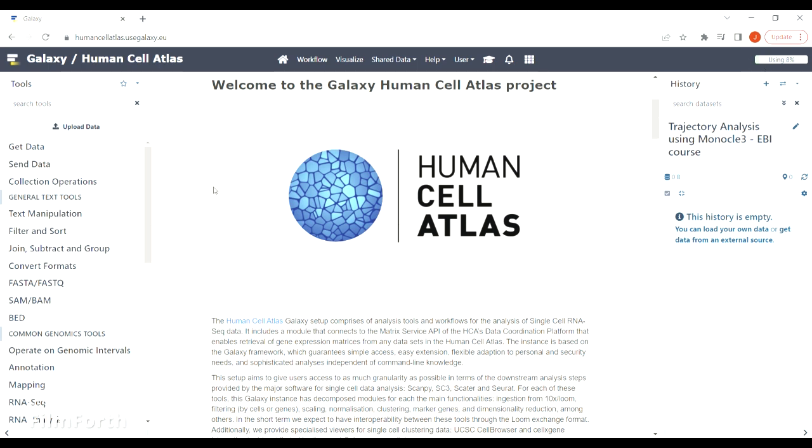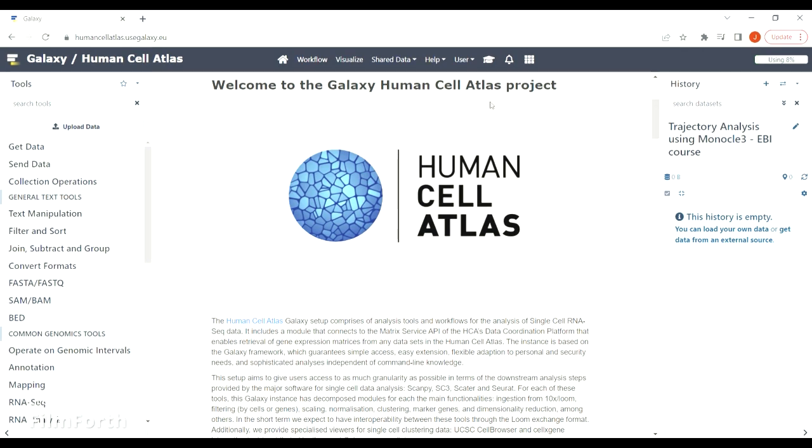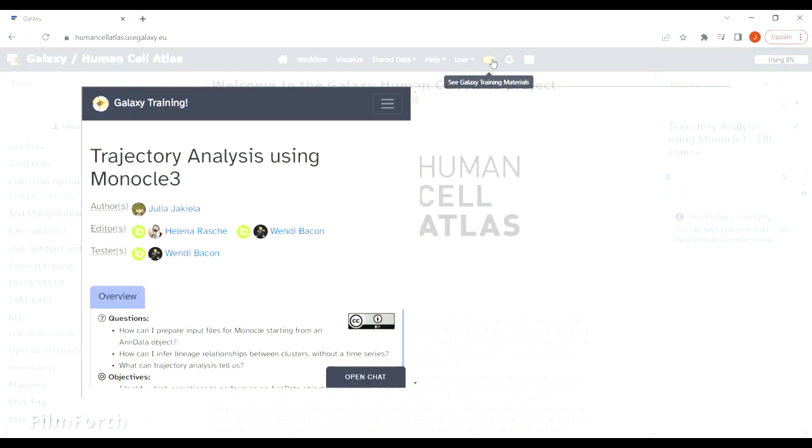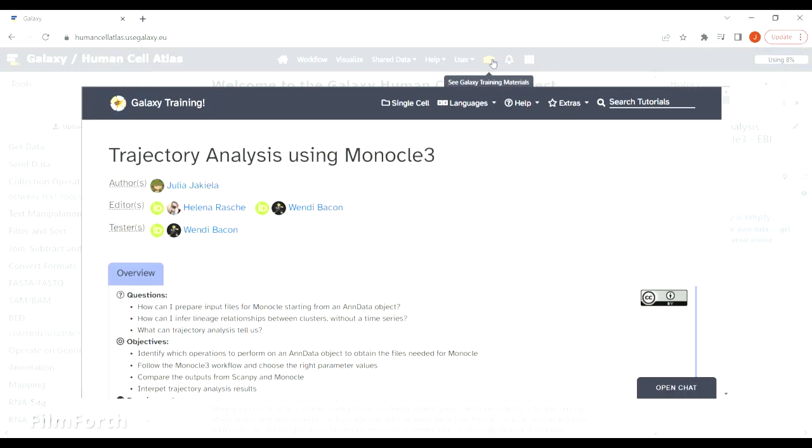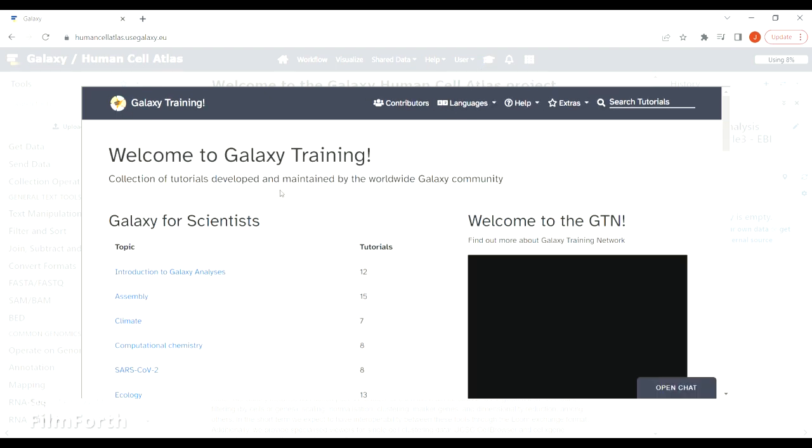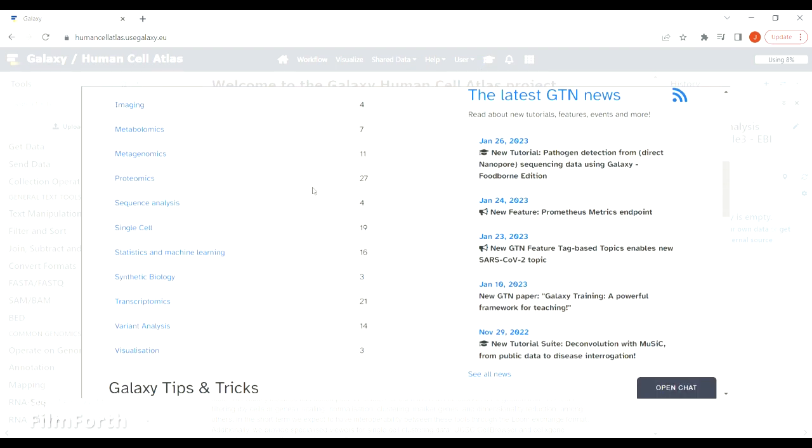You don't have to have another window open with the tutorial, but it makes things easier when you click on this icon which opens the tutorial mode and you can easily navigate to the tutorial you're doing.